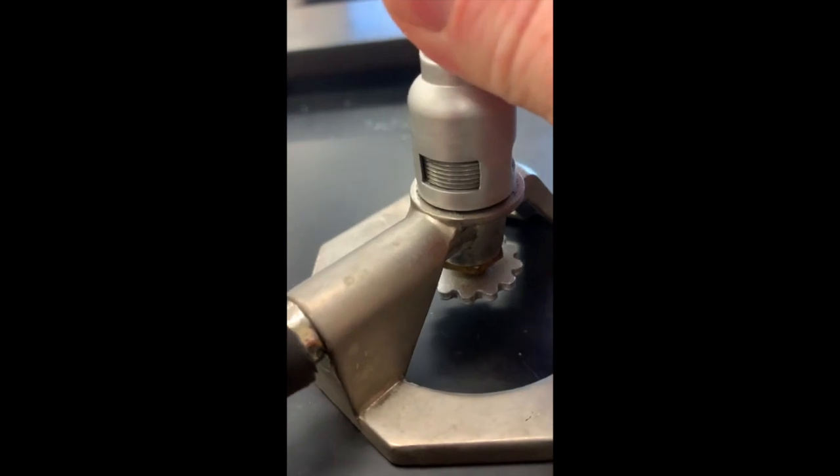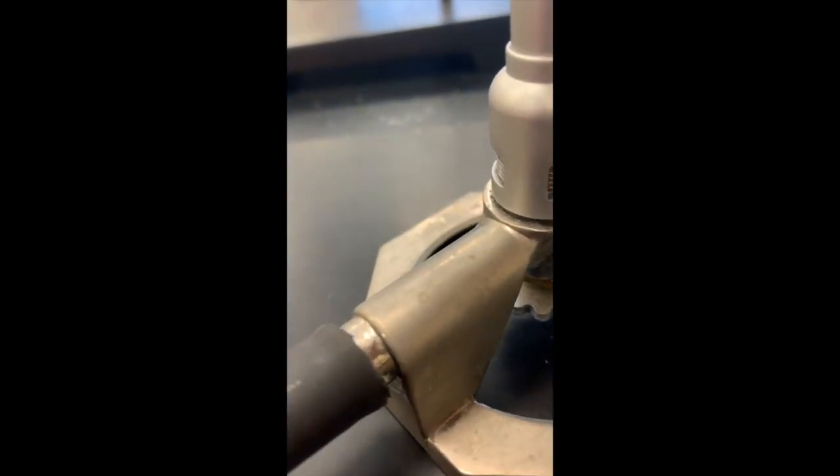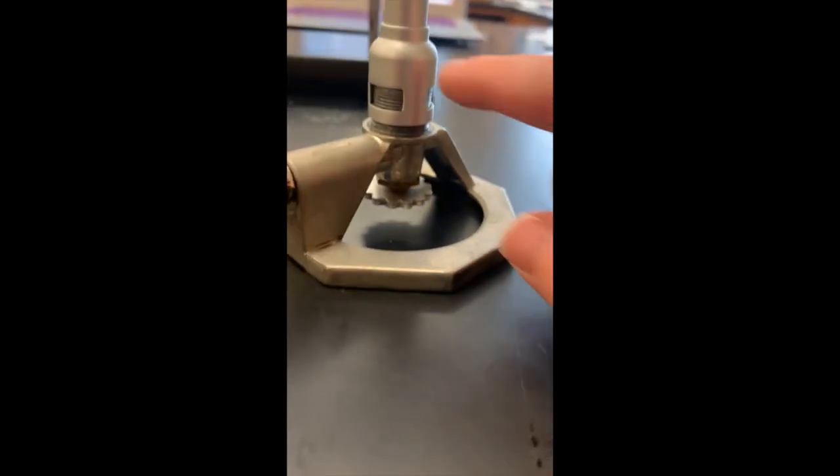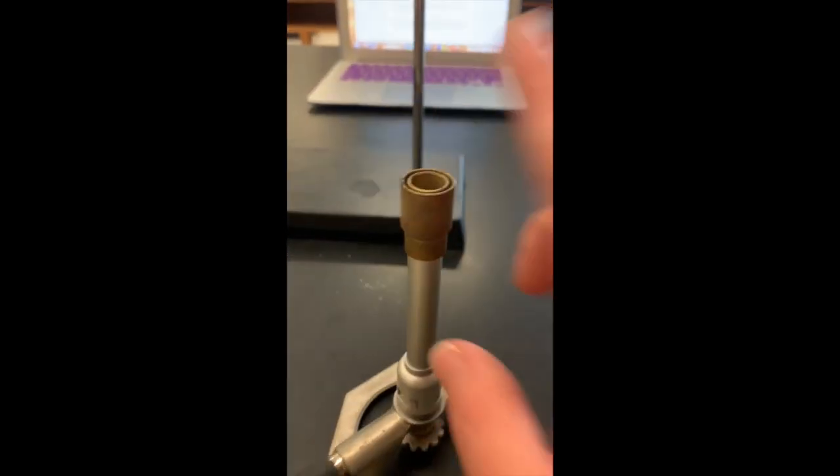Now we're going to take the top of this Bunsen burner and twist it four times to get a little bit more oxygen flow, which means the flame should be blue.